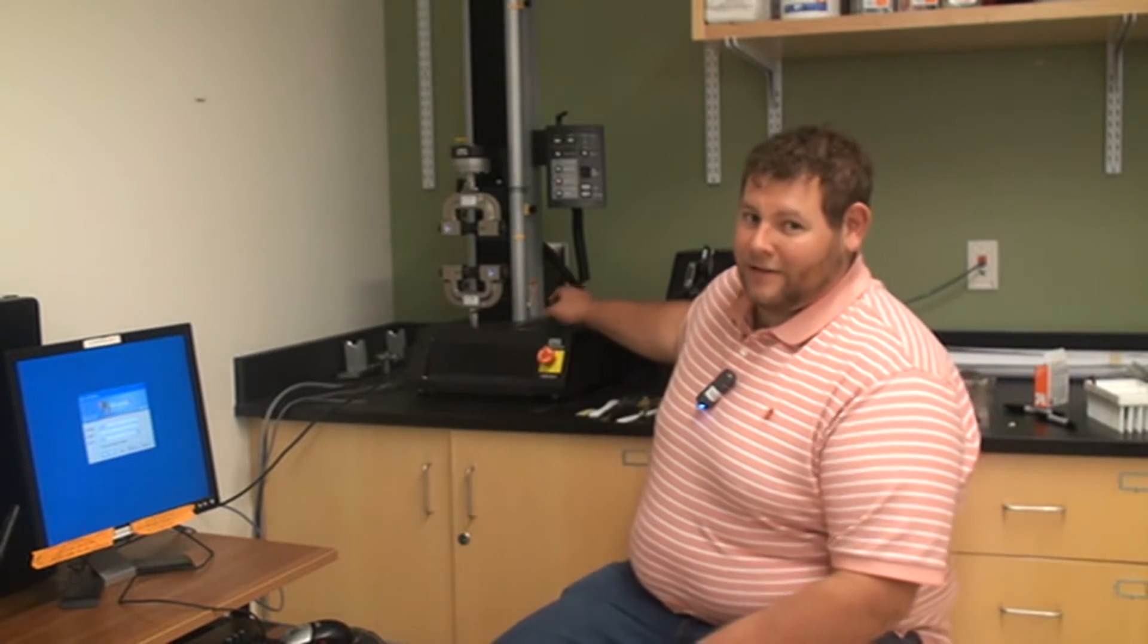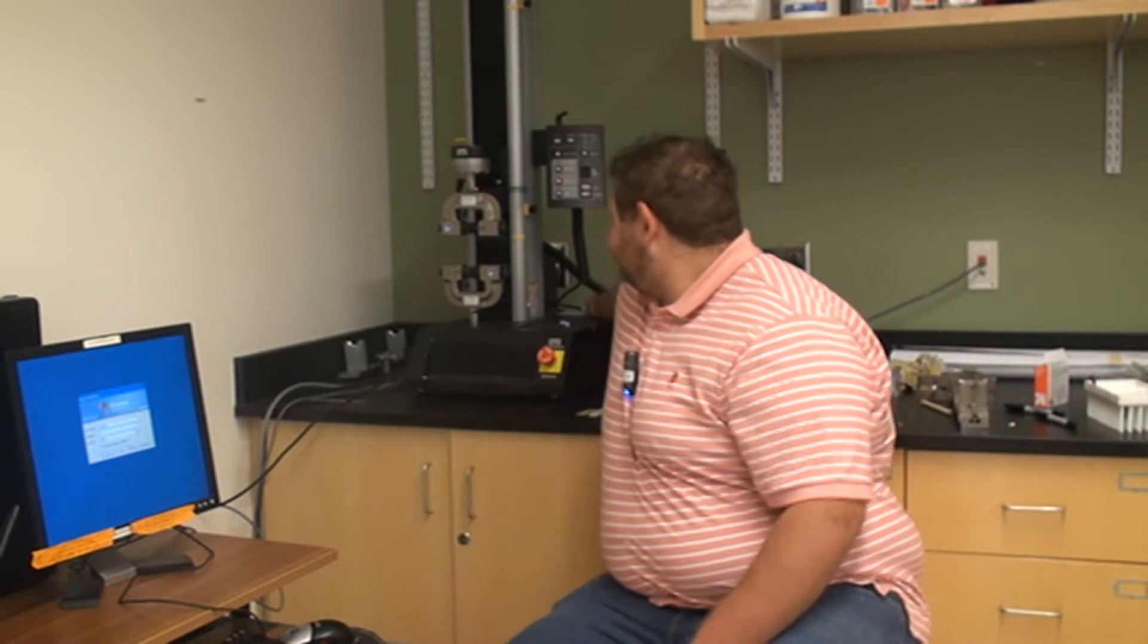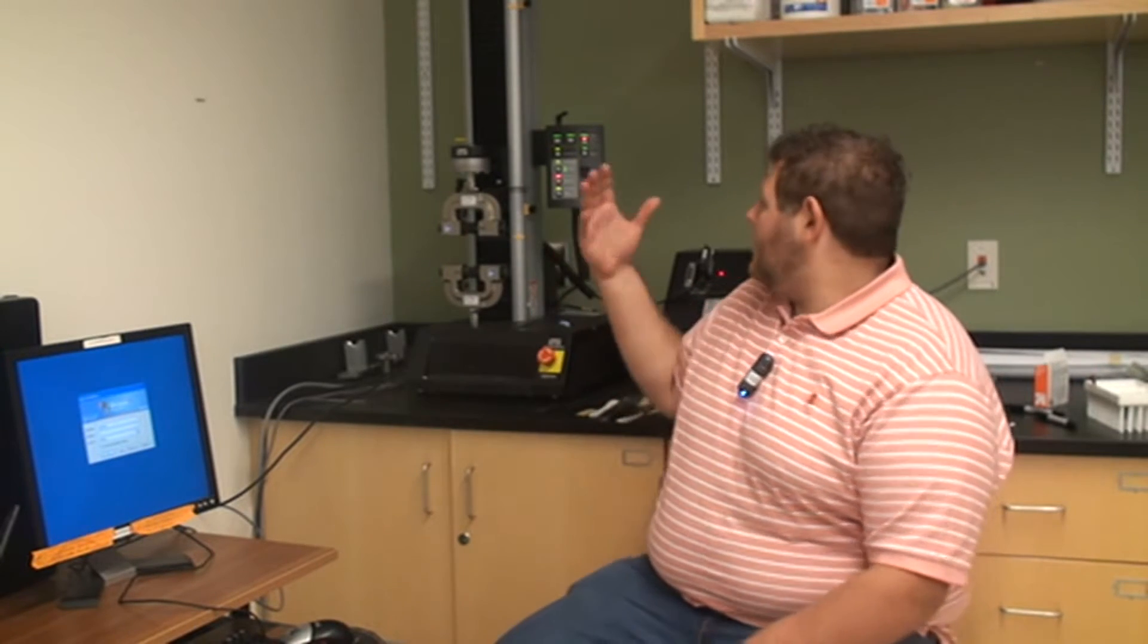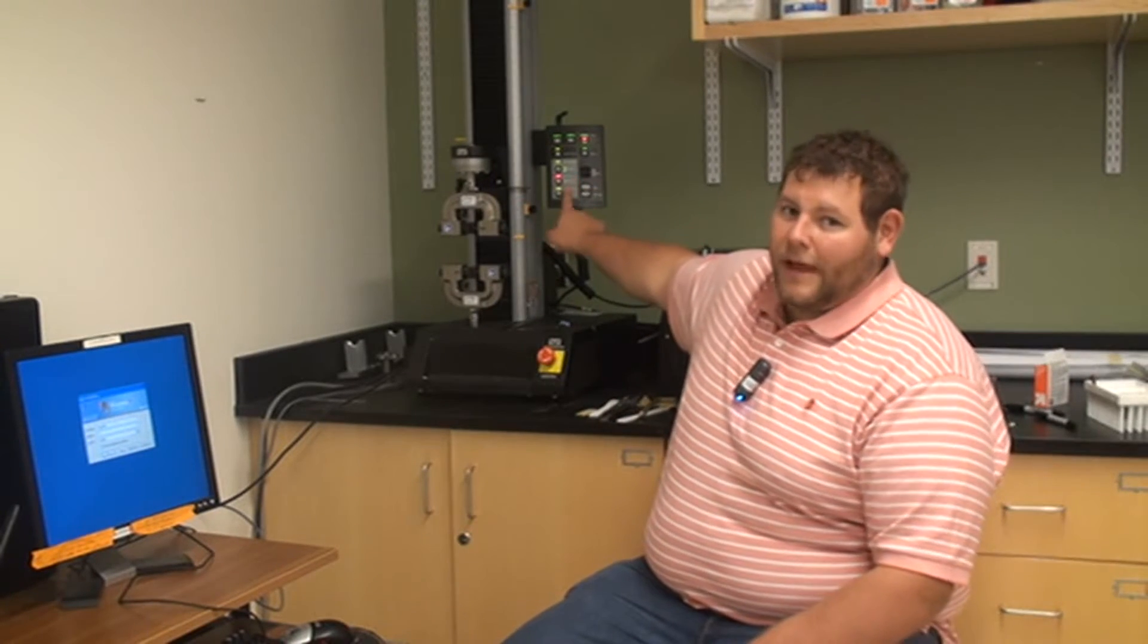The first step in turning on the Instron is, surprisingly enough, going and hitting the power button in the Instron and that is located in the back right hand corner of the Instron. The way to tell that it's turned on is you'll hear the machine kind of gear up as well as the control panel will start to light up.